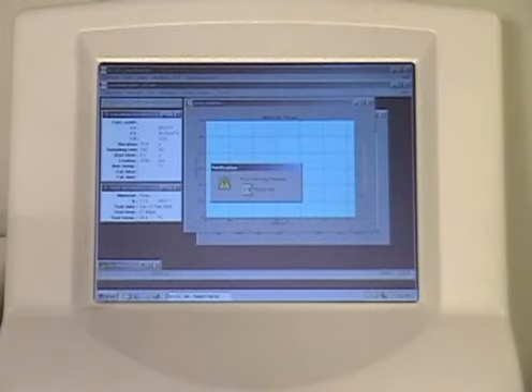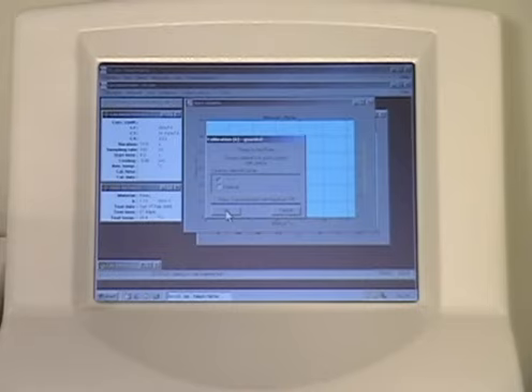Each reference material should be tested twice to ensure reproducibility. Therefore, click the Start Calibration button in the top left-hand corner to repeat the first test.